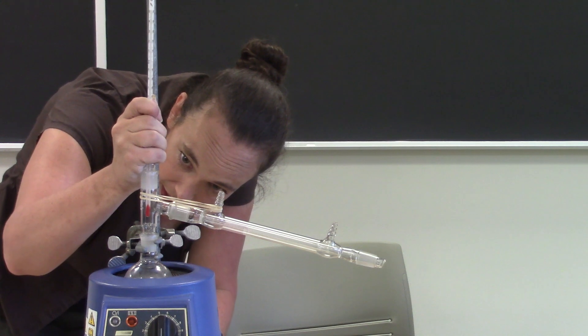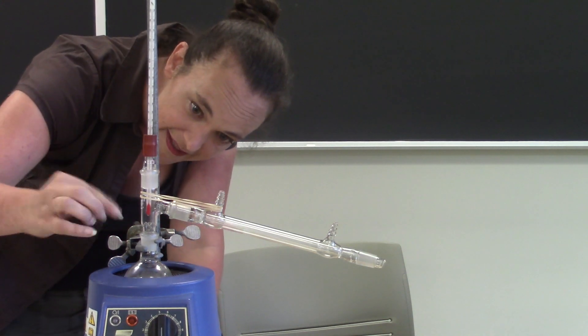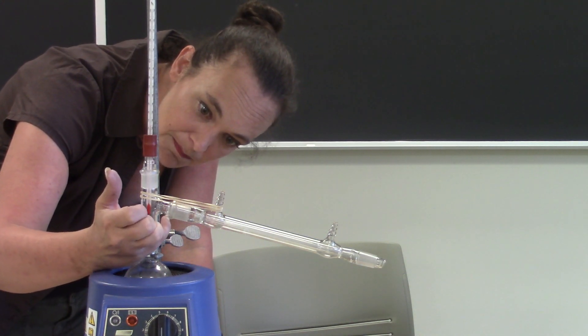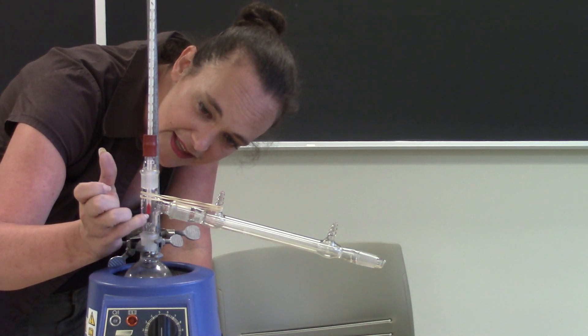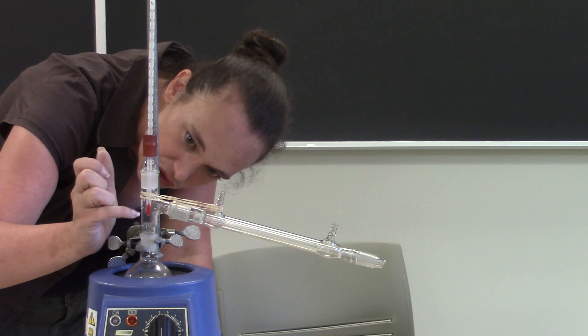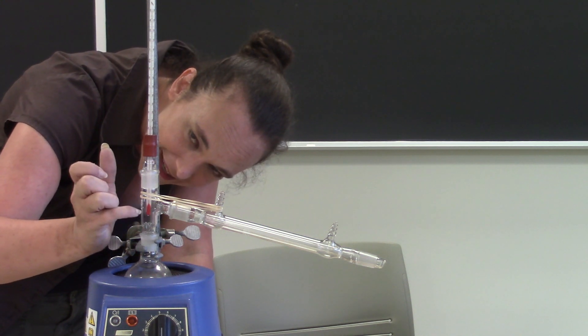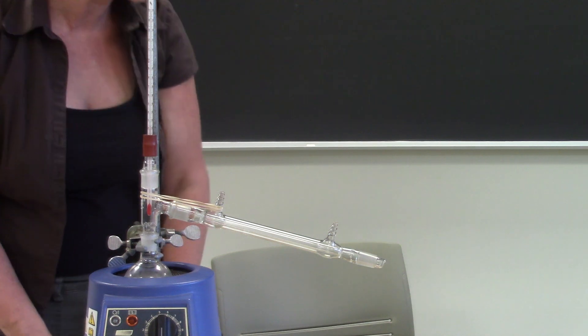Just like that and then we're going to slip that back on and you want to make sure that the thermometer bulb is kind of bisecting, if you look at the bottom of the joint that goes out to the condenser, kind of form an imaginary line connecting that all the way to the other side, you want your thermometer bulb to be kind of bisecting that line. That'll give you the most accurate temperature reading.